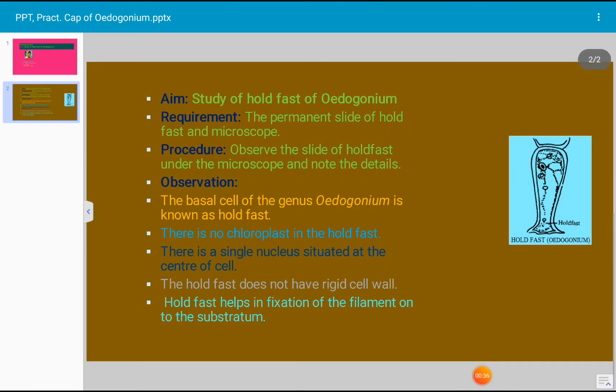Let us see what we have to do in the practical. First, the requirement of the practical: we need a permanent slide of hold fast and microscope.